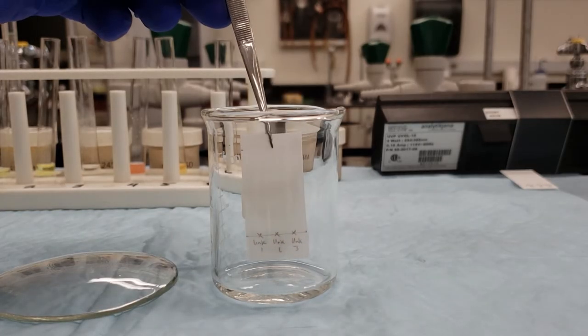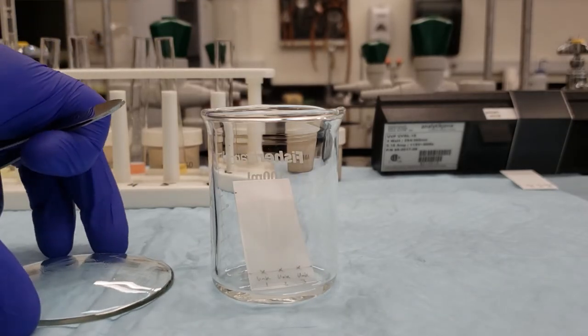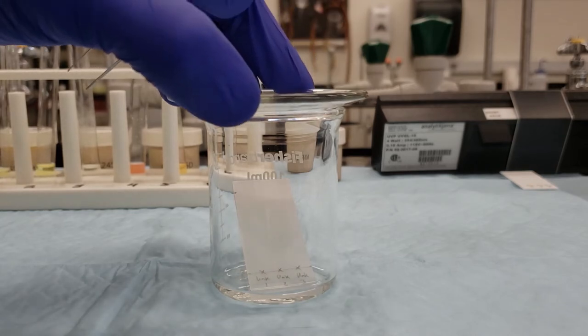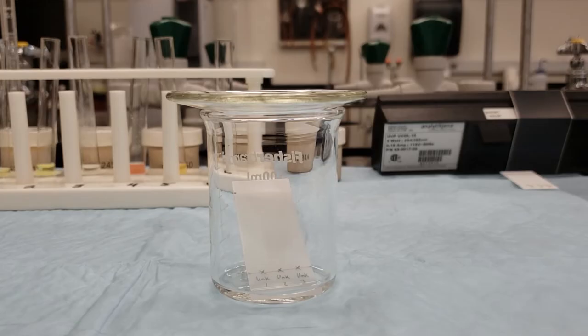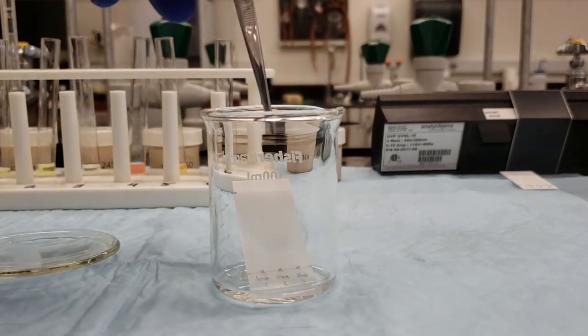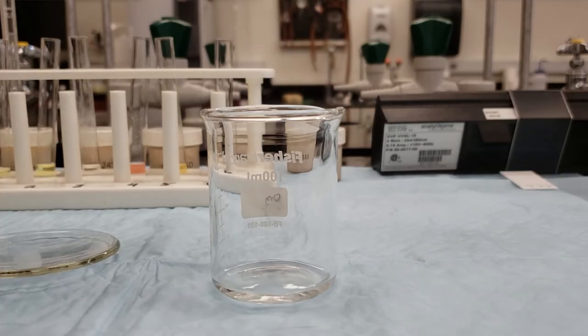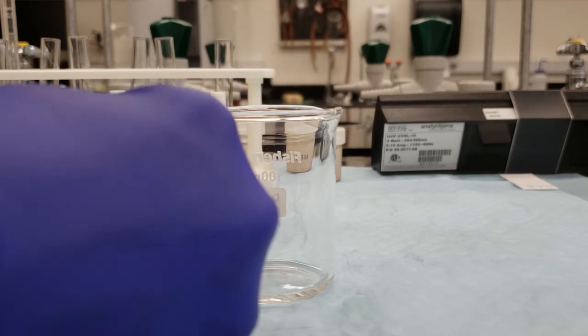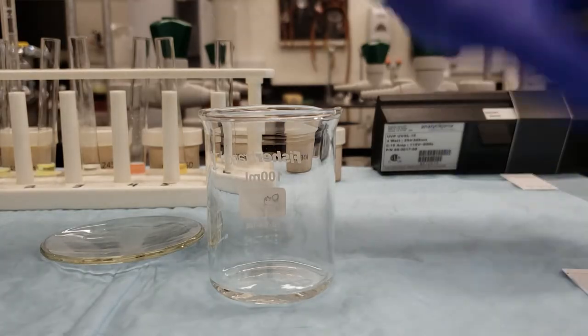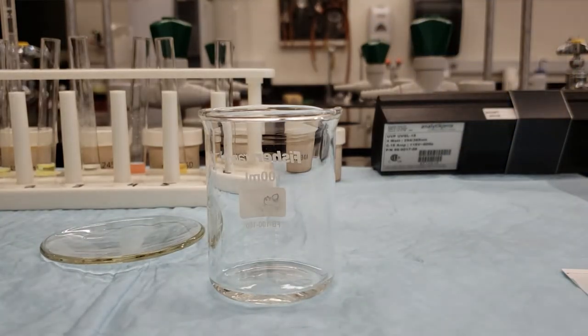Checking our solvent line, we find that it hasn't quite reached the top yet, so we'll place our plate back in and let it develop for just a little bit longer. All right, our solvent line has reached our mark, about a half a centimeter from the top of our plate. We'll remove it gently, go ahead and mark the line, and we'll set it aside to dry. In the meantime, we'll put in our second plate and allow that to develop.